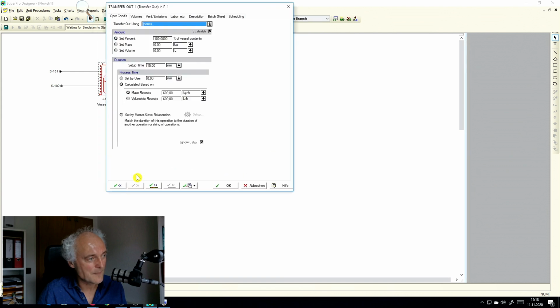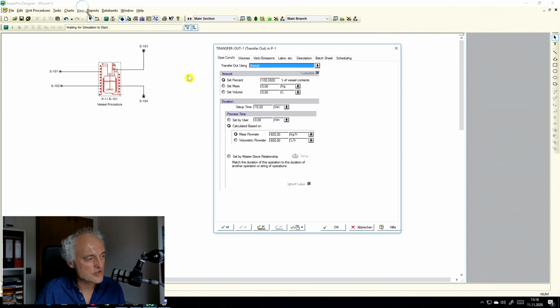Okay, next operation. And now we come to our transfer out. And the transfer out stream, this is this one here. This is this 104. So we use stream 104. Here we are. And there, everything else we will leave as it is because it's just a transfer out. So it's just pumped out, and we don't have to care anymore because this is what is being reacted, then is being pumped out. Okay.